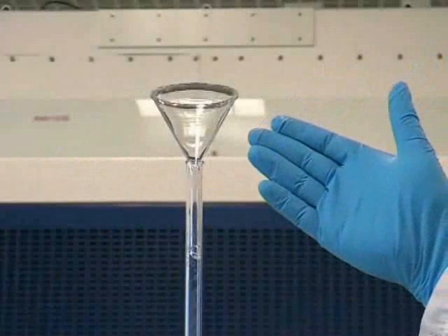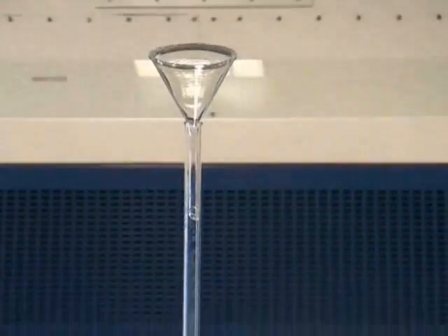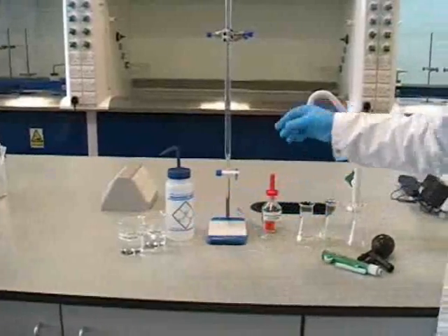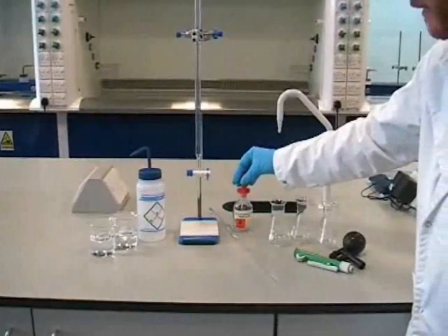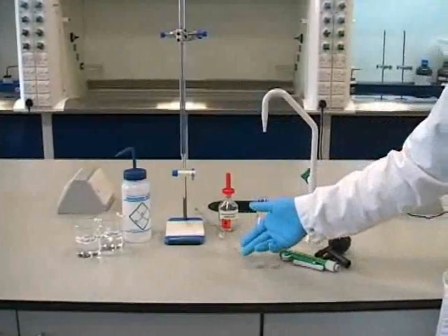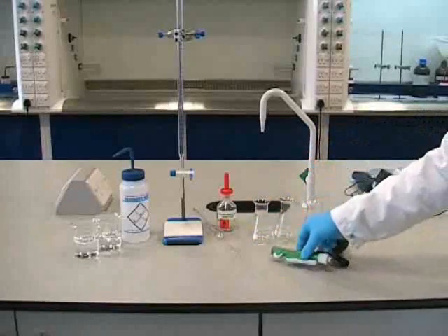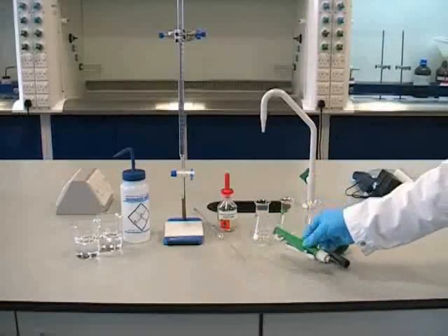Before filling a burette, we should make sure we've placed a small glass funnel in the top. We should also make sure we've got the rest of the equipment we need, including solutions, distilled water, a suitable indicator—in this case phenolphthalein—a 25ml volumetric pipette, three clean conical flasks, and a pipette filler. Two examples of these are shown on the screen.